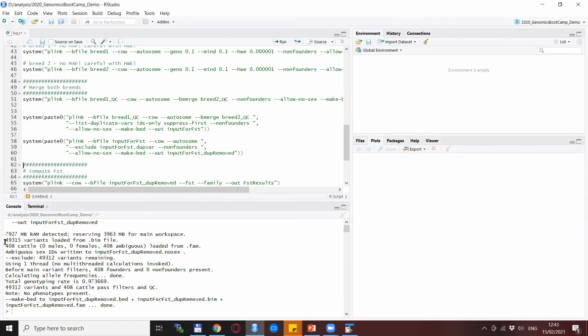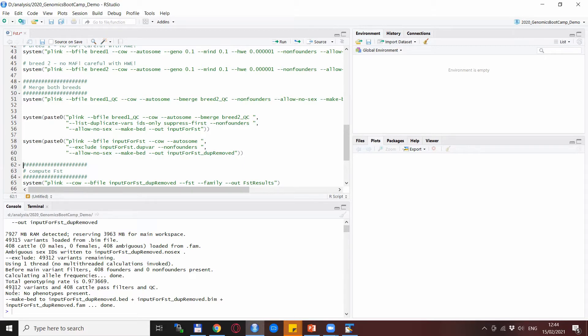You see that we started with 49,315 variants and we excluded just these three variants and ended up with 49,312 variants.